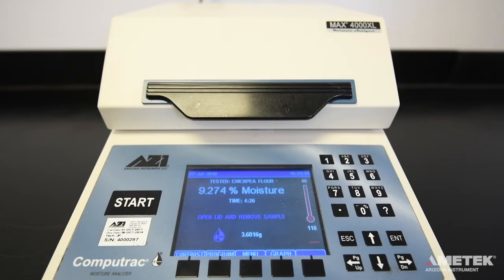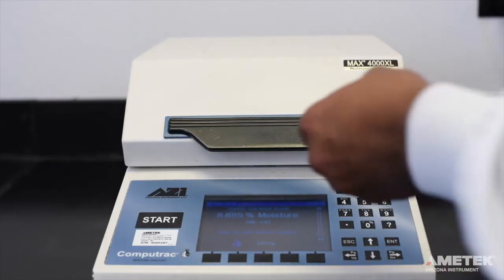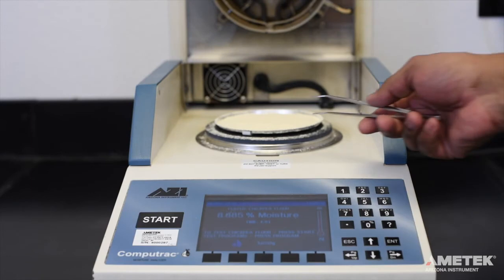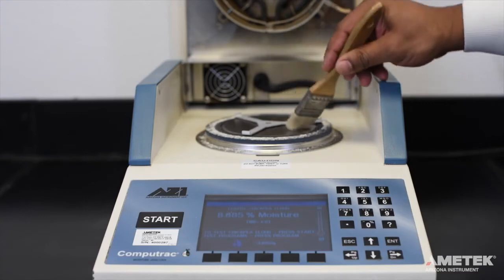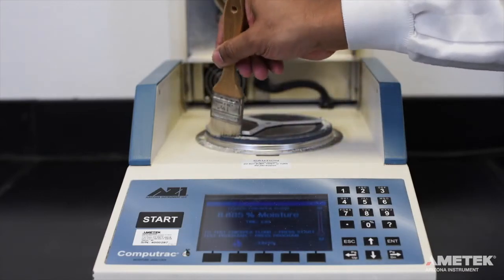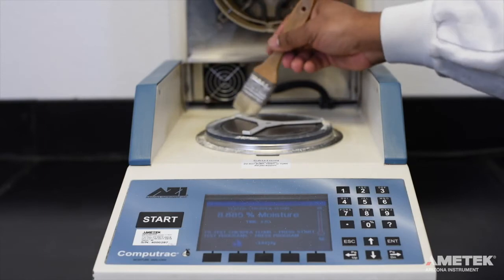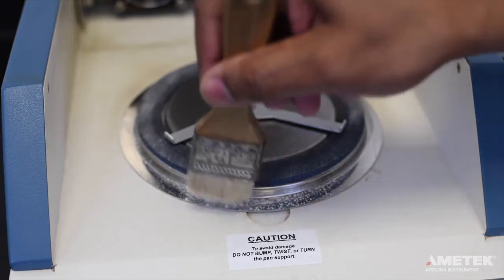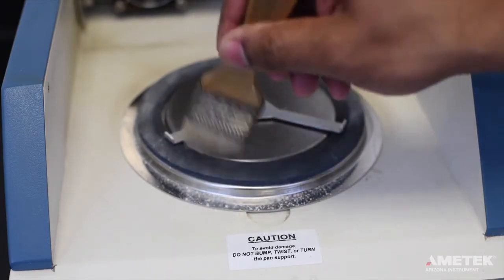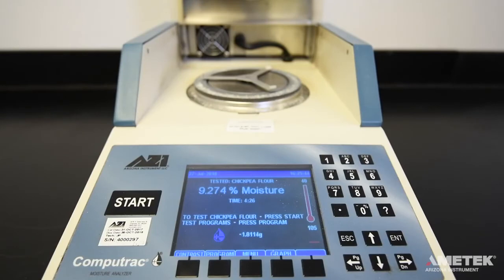The internal cooling fan can turn on to help cool the instrument down for the next test. To get ready for your next test, open the lid and use the tweezers to remove the sample pan with the old sample. Both will be very hot, so be careful not to burn yourself. You can use a small brush to gently brush any excess sample that ended up on the instrument away from the center of the pan support. Do not brush towards the center where the pan support is installed. If the sample is brushed into the hole where the pan support is installed, it can negatively affect the balance.